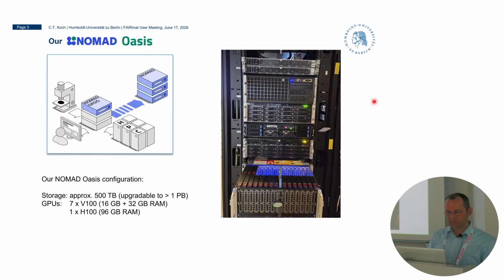I've been asked what kind of hardware do you run for the research data management. Our NOMAD Oasis runs within a little rack that we have within the department's computational infrastructure. We bought a few servers there over the years. We had started with one and it became two and so on. Then we realized we also need to do heavy data processing, and so we invested also in GPUs.